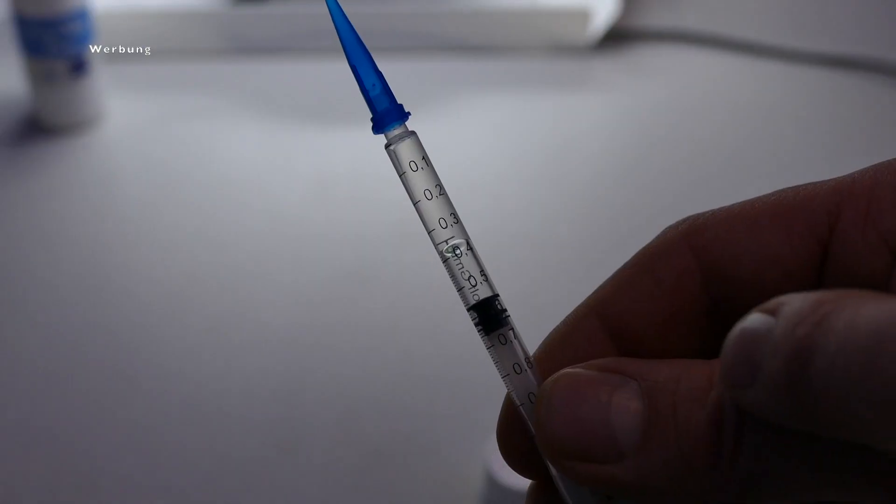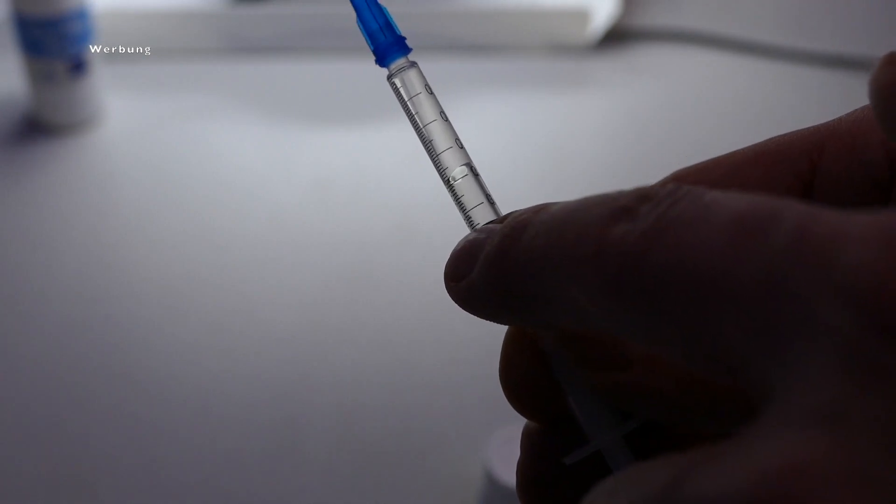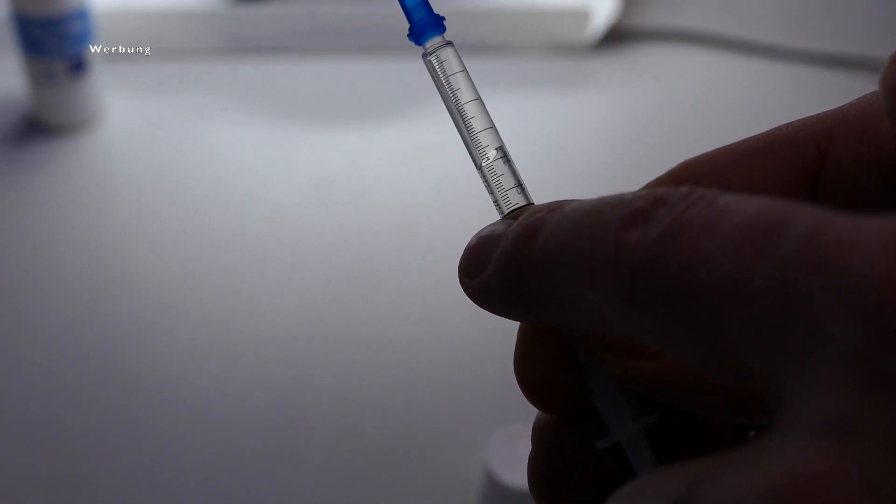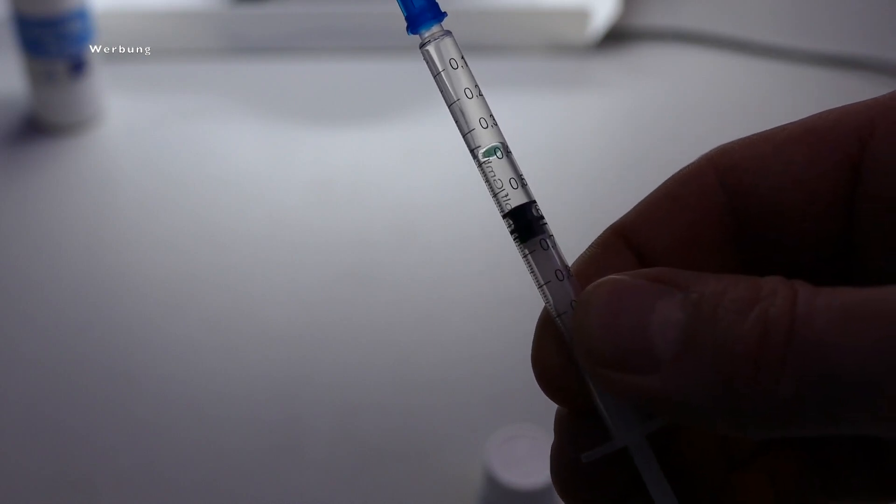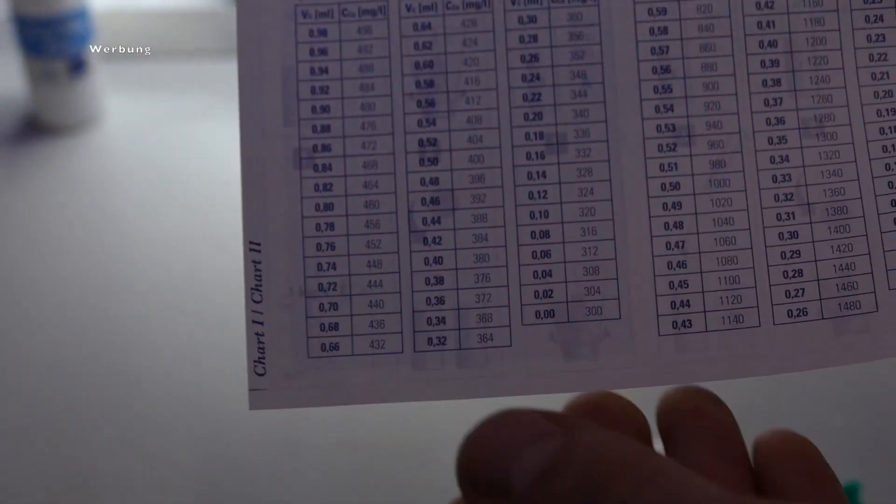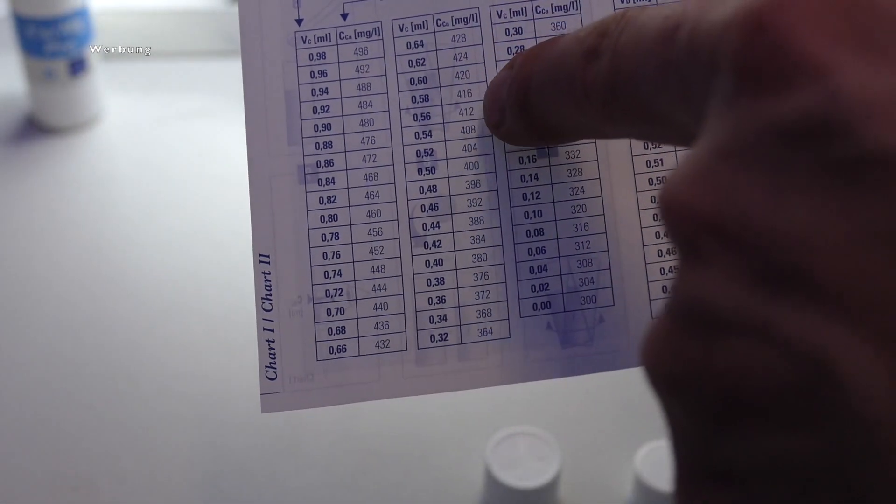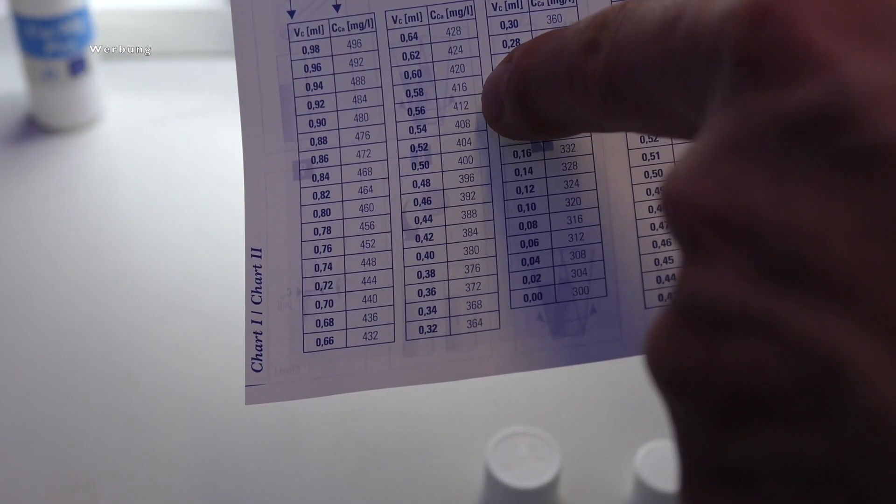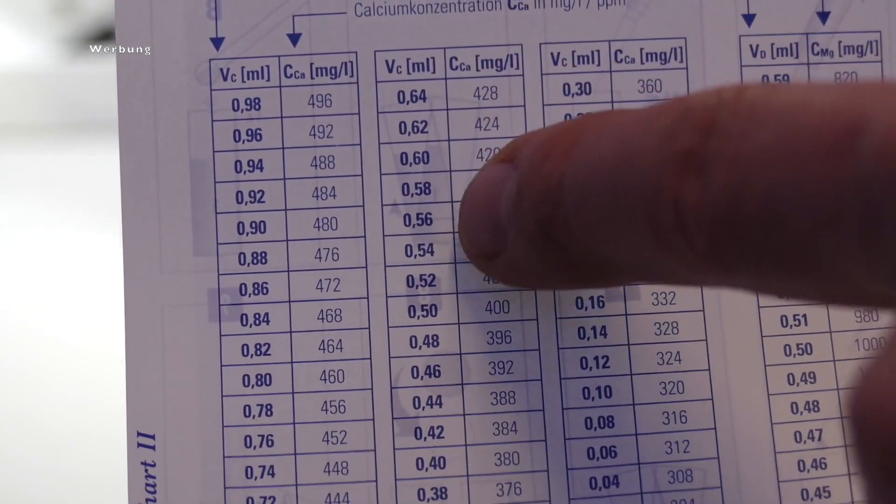So we come to the evaluation and see what our calcium level says. So as we have learned, as soon as the sample becomes colorless, the remaining amount of test reagent in the syringe is then read off. Remember where we read, on the black edge of the plunger. And with this amount you have, you can then look up in your chart what your calcium level is. Well, in my case, I now have a value of 412 milligrams per liter, which is in itself quite good.